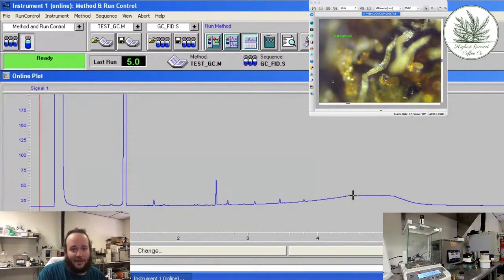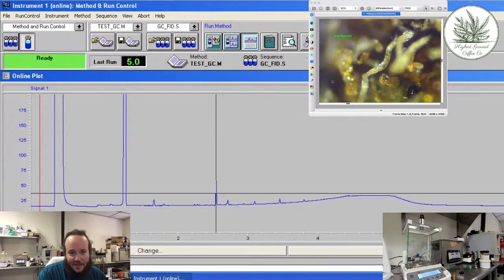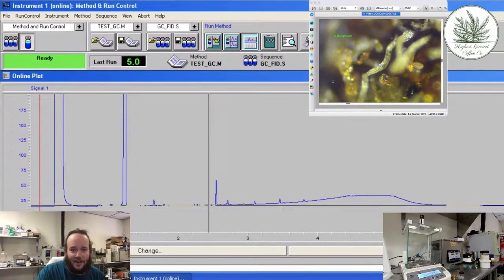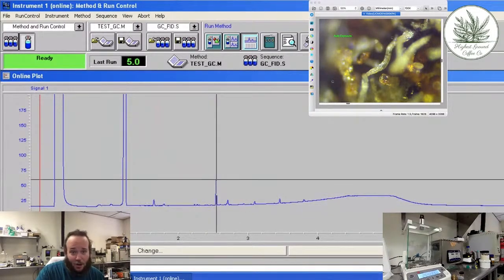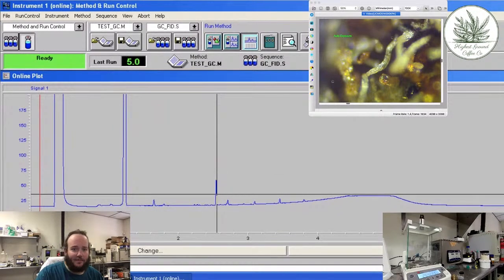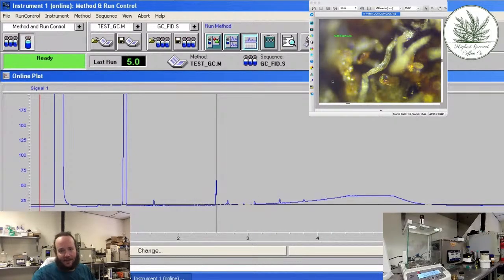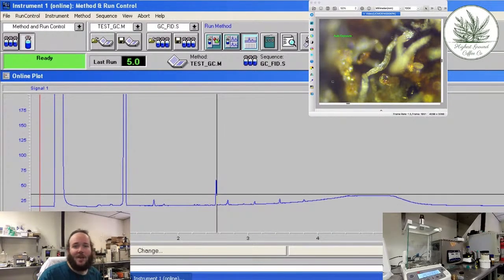So Phil, if you wanted to know real quick how worthwhile your leftovers were, this is the only peak of significance, and it is very insignificant. So I would say you did a very good job of extracting. What this peak shows me is there's a very, very trace amount of THC in that white jar thing that we ran, whatever you want to call that guy.